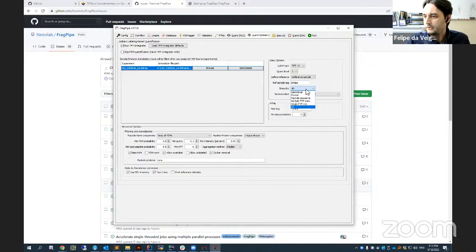I use a FASTA file manually compiled with my target sequences instead of files downloaded from some databases. In this case, when I try to add decoys, nothing happens. One of the things you should do first, if you have a custom FASTA database, and this is probably one of the most common issues we have today, is that the FASTA databases need to be properly formatted. The headers need to be in a way that the programs can use them, because there are several elements in the headers that can be used by these different programs to find the protein ID or the gene ID or the description. If you just write a custom format using your own format, it might be a problem.